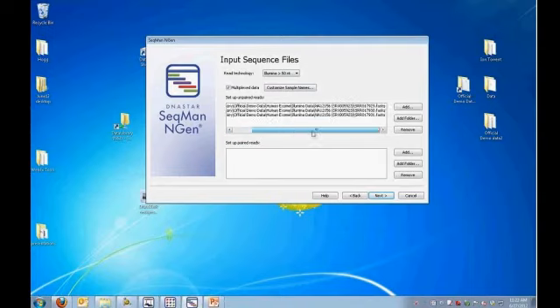In this example, I've loaded 3 FASTQ files that are Illumina data. And FASTQ is a pretty standard format. It's typically the Illumina-like, where we'll have base scores and then quality scores in ASCII code. Ion Torrent and 454 also have SFF files, which we are compatible with. And so those are the 2 predominant formats for data. There are some older formats that we accept as well.